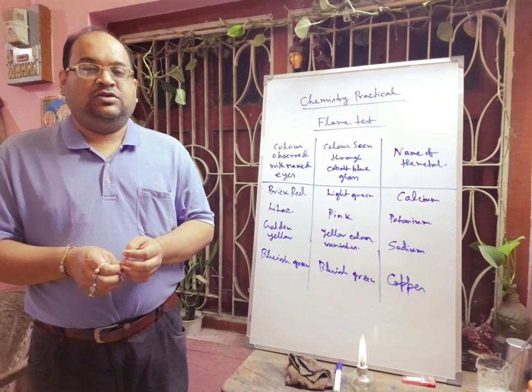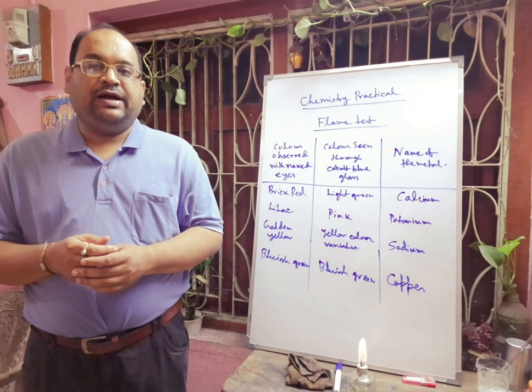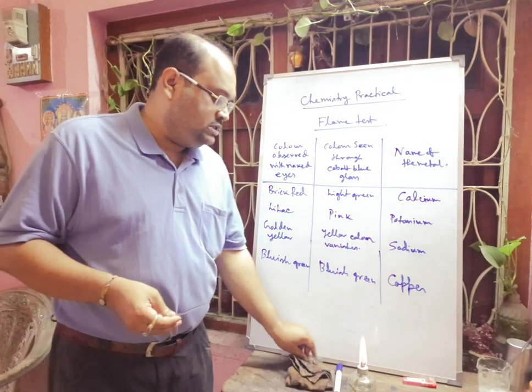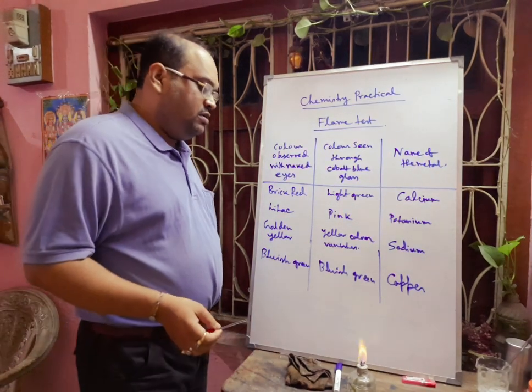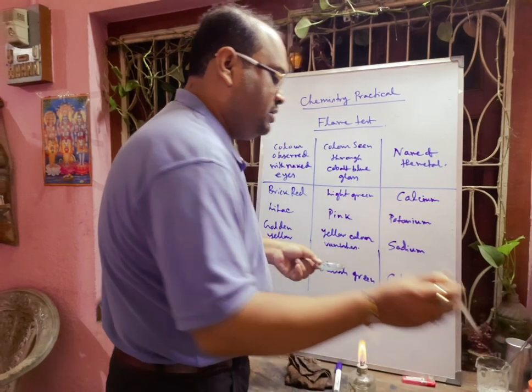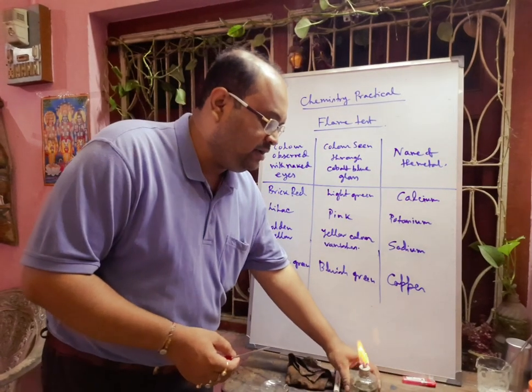First, we have to take a very thin platinum wire and clean it by dipping in concentrated HCl. This is your platinum wire — you can see there is a loop. Now we take some concentrated HCl in a watch glass and clean the platinum wire.